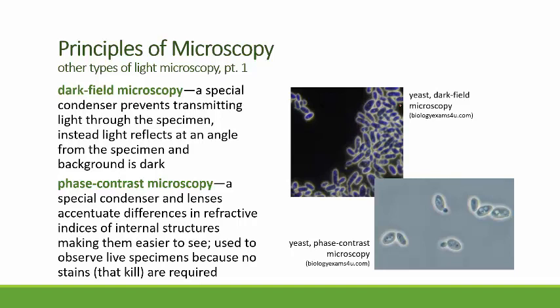And you can see things like motility, their ability to move. That's the term that I just put out there. With phase contrast microscopy, because you haven't killed the cells, they can still move around. And if they've got flagella that move them around, then you can actually see some of that movement.